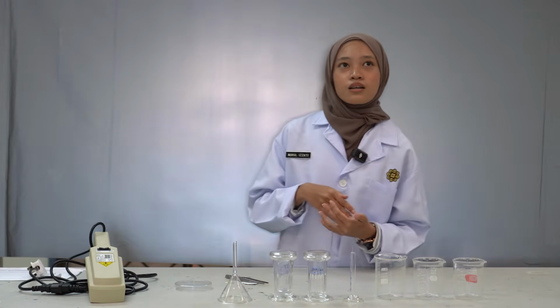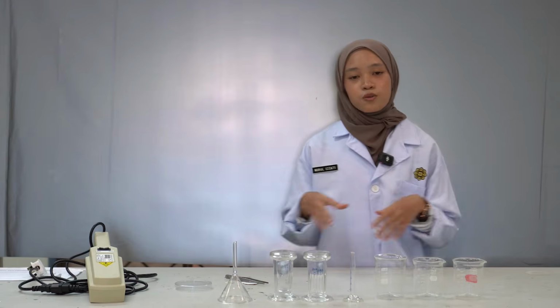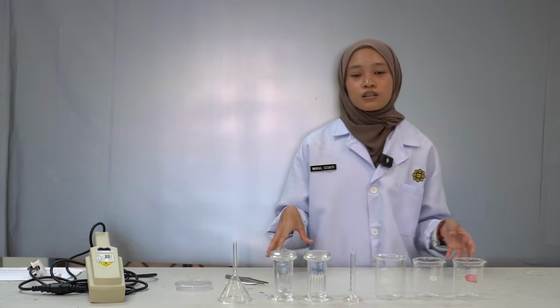In the pharmaceutical industry, TLC is a method used in large amounts for quality control, and it is mainly for purity testing. For example, when a chemist wants to produce a batch of a drug like paracetamol, a technician needs to test its purity. So they spot the new paracetamol that they want to produce next to a paracetamol that has been standardized and see the result.